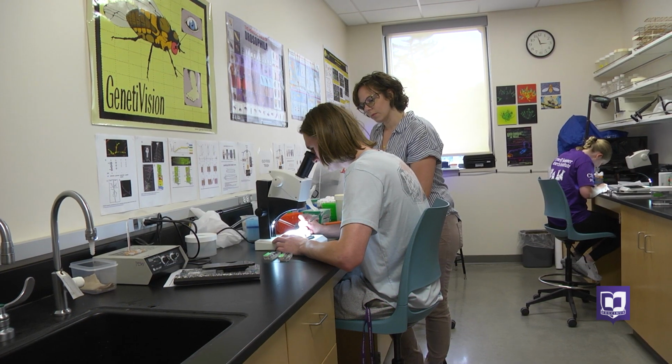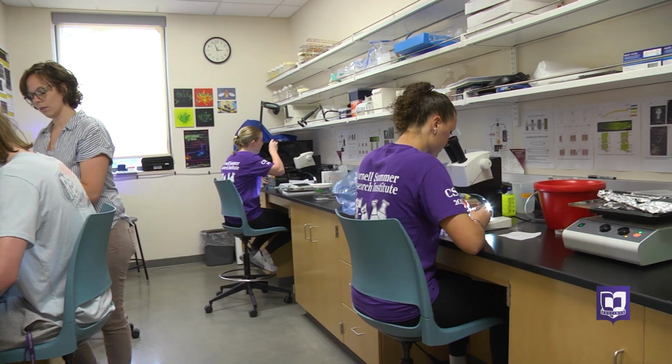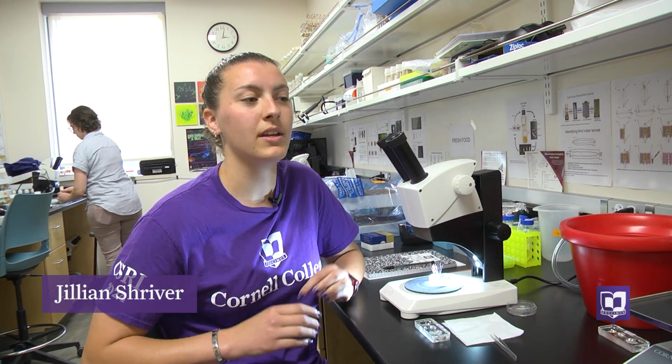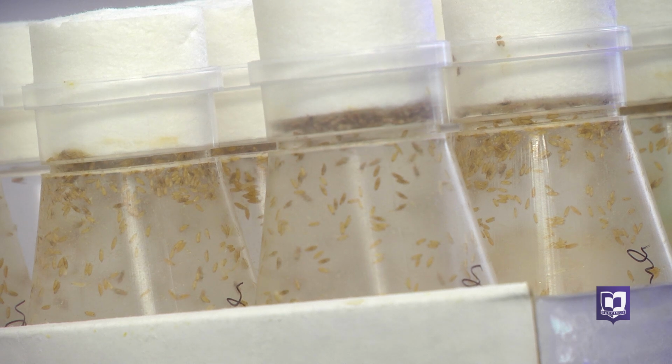Basically, we're working with flies, and the specific fly we're working with is fruit flies. We're dissecting larvae of regular fruit flies, which we would expect to have normal muscle development, looking at how that muscle looks under a microscope. And then we're also dissecting flies that are fed aspirin. We're going to be analyzing them to quantify and figure out how aspirin affects their muscle development as well as how it affects their neuromuscular junctions.